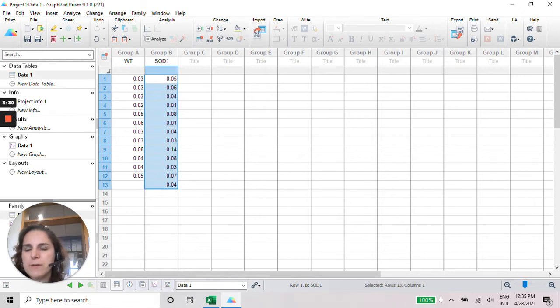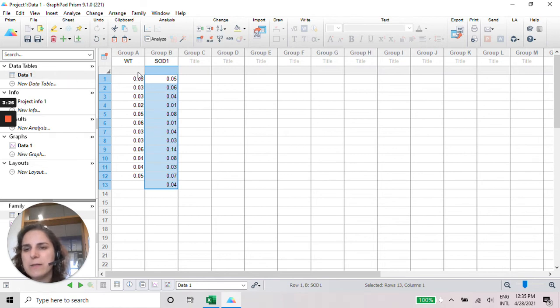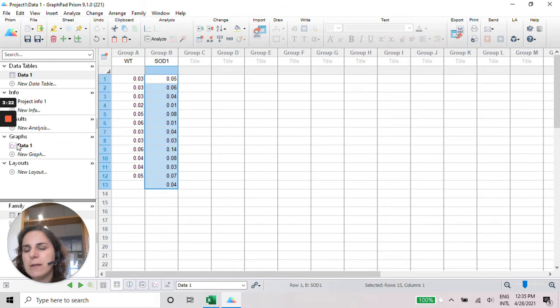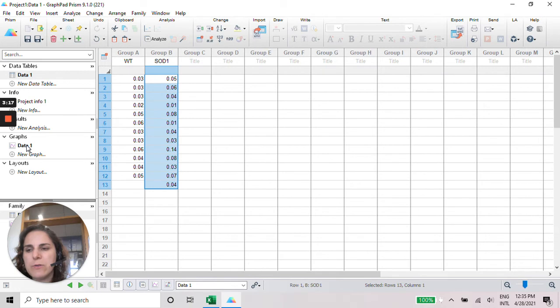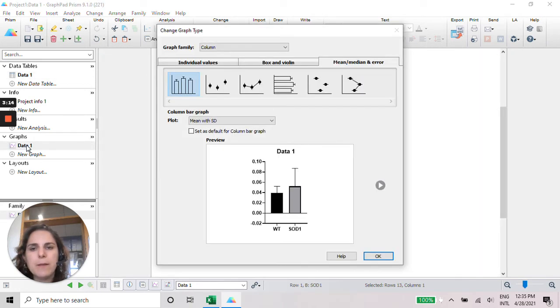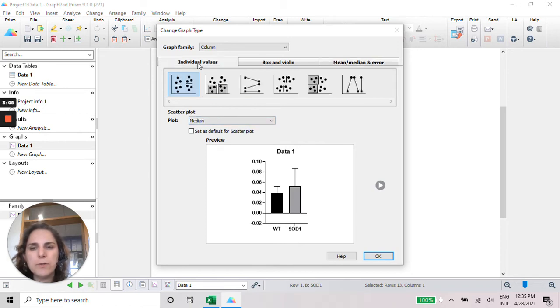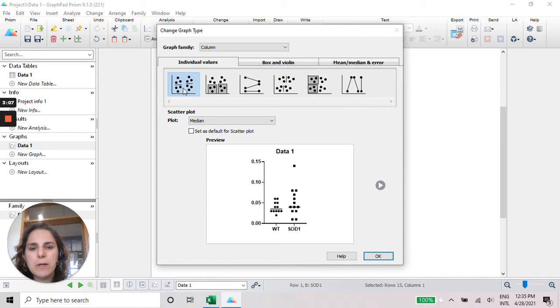After this is done, we can go to the... So we added this in the Spreadsheet Data 1. And that's going to be represented in the Data 1 graph. So we just need to click in here.